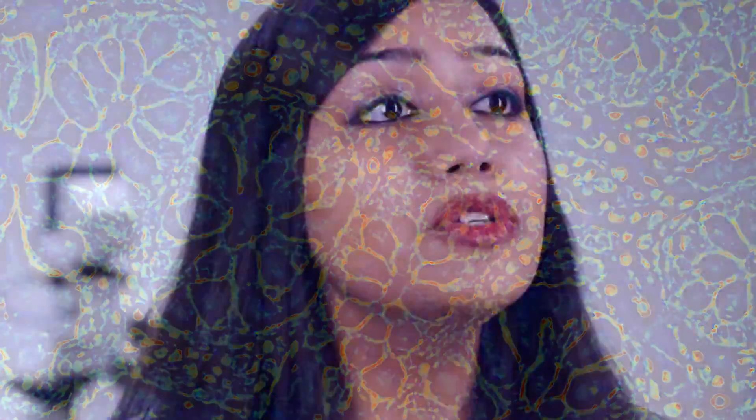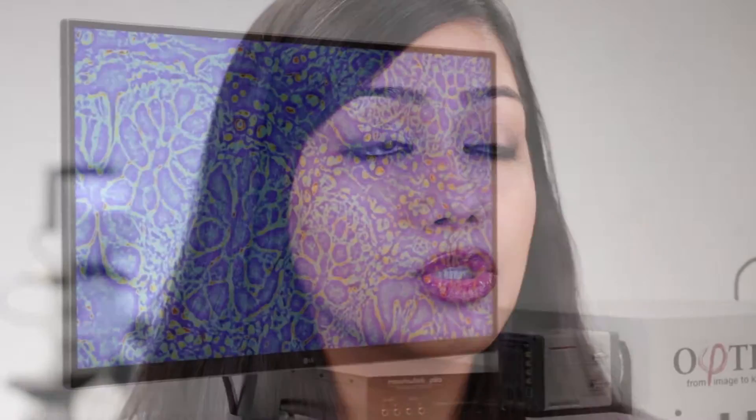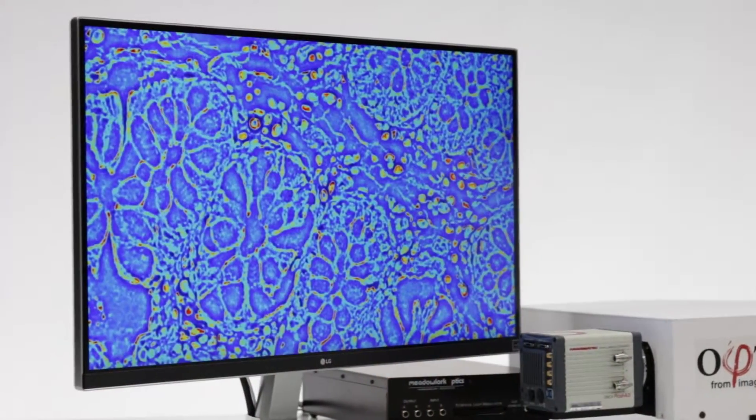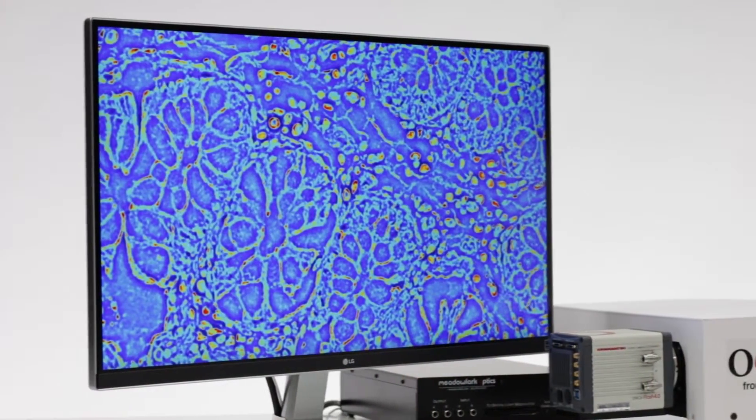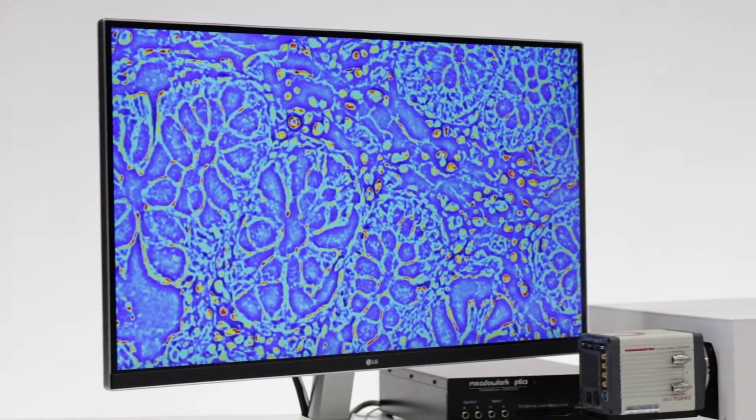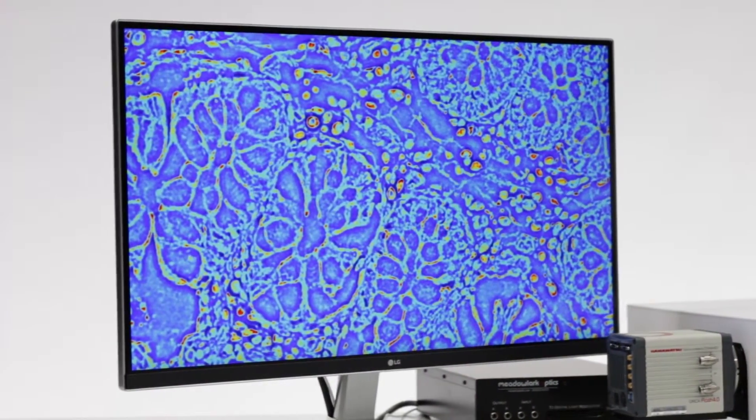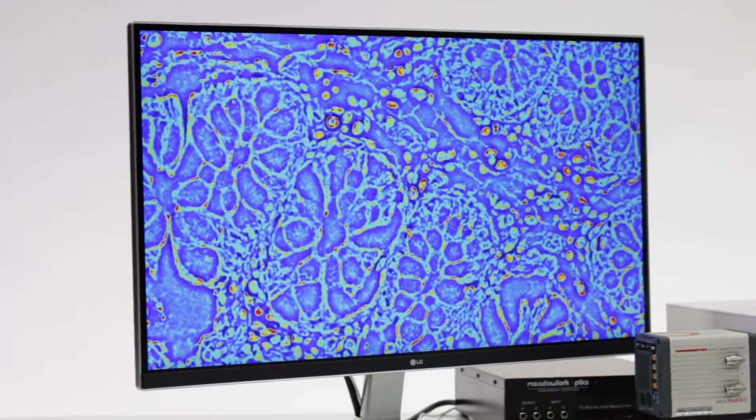SLIM can extract unique information about the tissue structure, which is valuable for the diagnosis and prognosis in cancer pathology.